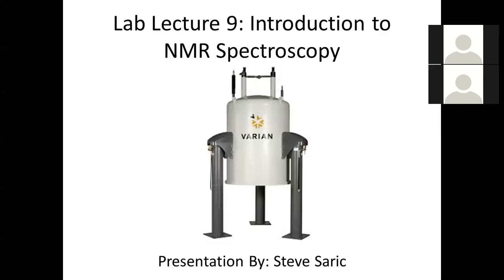So basically what you're doing this week is NMR spectroscopy. And this is a very, very powerful technique. It's very different from a lot of the techniques you've learned already in the semester in that it is more of a qualitative technique than a quantitative one. If we start from the very beginning, the first thing to ask is, well, what's spin, right? So nuclear magnetic resonance. We're talking about spin flipping nuclei of different molecules, right?